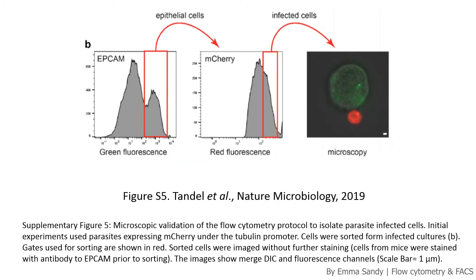This is another way to represent the same data — by histogram. Here we can also see how the host cells are selected. Similar to my data, the authors are interested in epithelial cells. First they selected EpCAM-positive host cells, then looked by red fluorescence for host cells infected with red parasites. Here we can see the host cells in green and the parasites in red. The contour plot and the histograms are two different ways to show the same data.